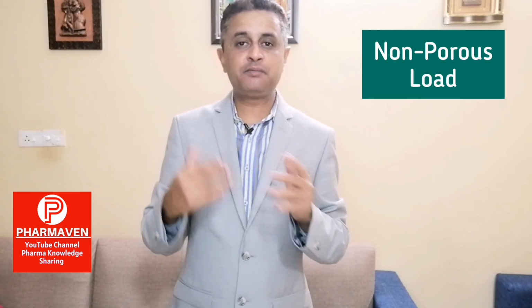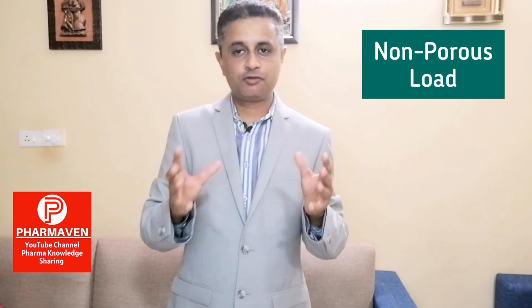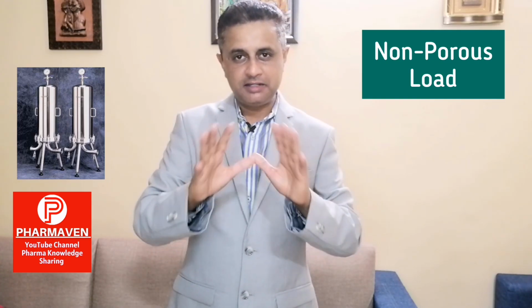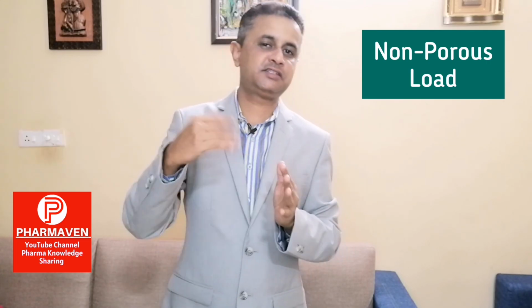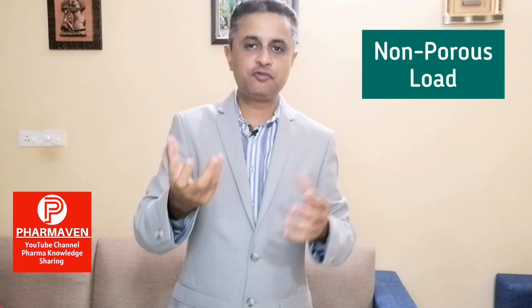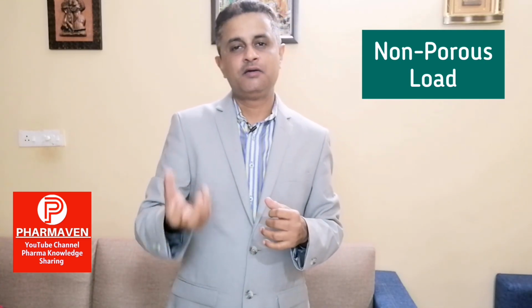So in a non-porous load, why is it different? It will not require much effort for air removal because there are no pores, there are no cavities, there are no small bulked items. So it becomes easy to remove air from non-porous loads. That's why it is categorized as a separate category, non-porous load. Porous load is difficult to sterilize because it requires effort to remove air from all the pores. Non-porous load is comparatively easy for air removal.